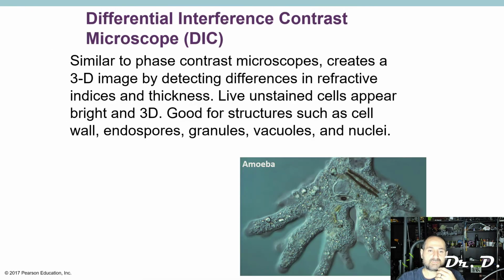So with this type of microscope, you're going to see 3D images. You're going to see like a 3D amoeba. Why? Because it uses polarizers similar to what a movie theater does. It allows this eye to get one information, that eye to get the other information. Suddenly you're seeing a 3D image. And of course, anytime you can see a 3D image, you're going to get a better sense of contrast than if you don't, right? So interesting stuff.